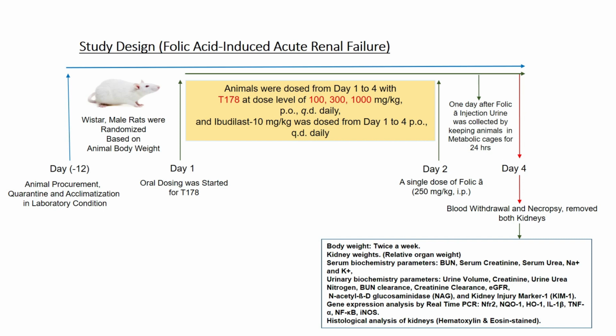So we have to dissolve it completely for 10 to 15 minutes until it becomes a transparent, orange water-like color. While preparing this folic acid, because sometimes it is not dissolved properly, induction of the disease will not occur. So this is how we have to start induction.